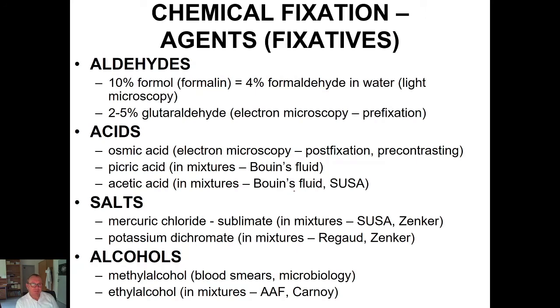Chemical fixation. As you can see, there are very many fixation agents, fixation solutions, or fixatives. But I would point out the first group, aldehydes. Aldehydes are really the most used fixatives worldwide, and among them formaldehyde is the most frequent and probably the best.